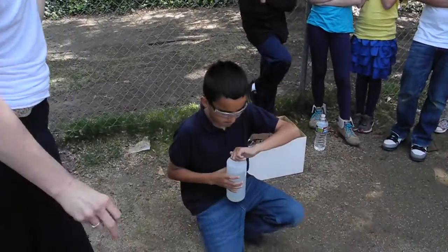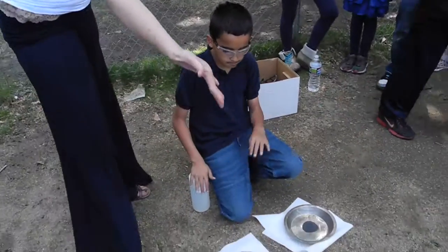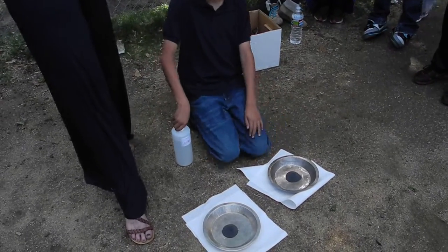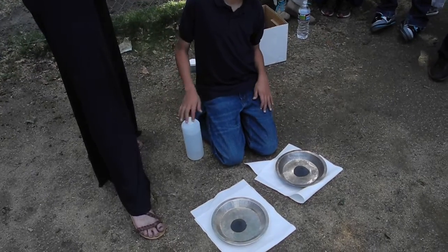So here's the scoop, ladies. Thank you. We agreed that when we pour this, we need to leave some oxygen. So do you guys agree with me that we don't want to cover the entire pile? Yes. Yeah, and so in Eric's case, when I give him the go-ahead, okay, he's going to pour.